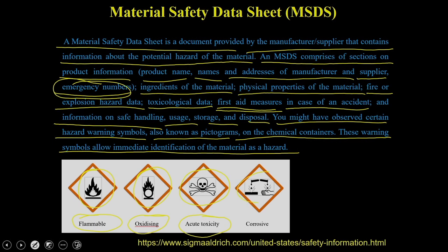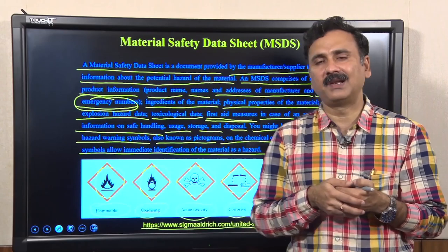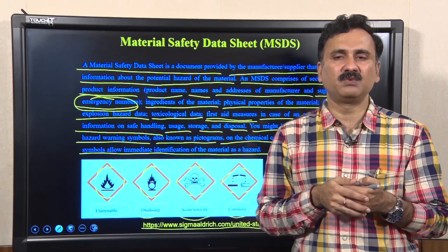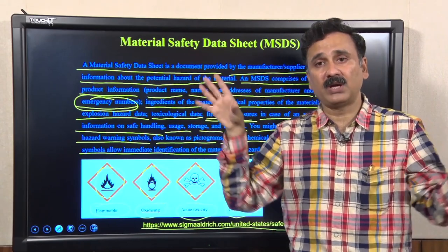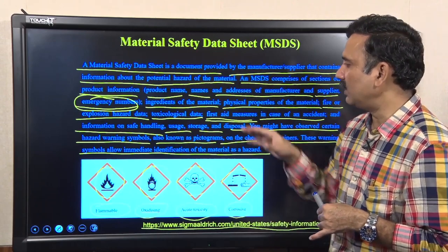Then there is a symbol indicating the chemical is corrosive in nature, meaning it could be a strong acid or strong base. You can follow Sigma-Aldrich catalogs — a link is provided that will take you to the Sigma-Aldrich website to show you what a prototype MSDS document looks like and contains all this information.